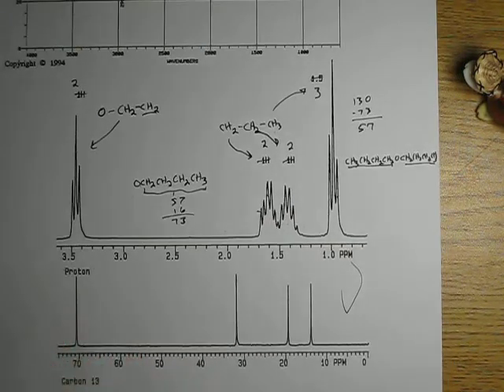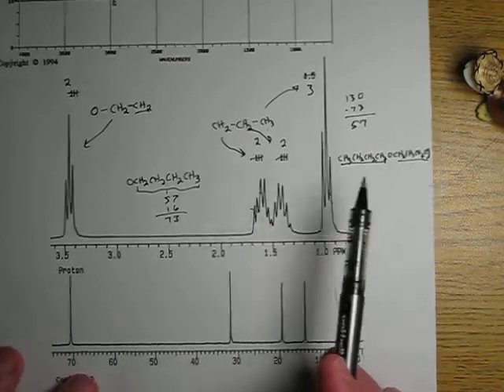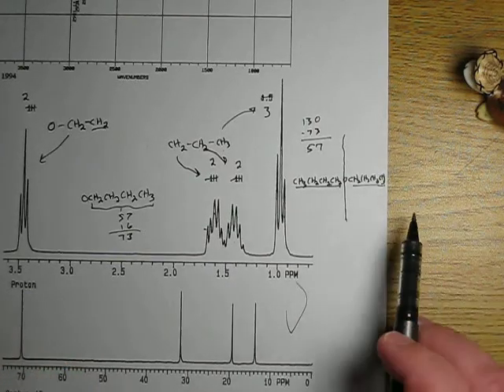Having symmetrical molecules is what really will give you fits when you're first starting solving NMR spectra. Because how would you know it's symmetrical? What told me it was symmetrical? There's nothing. But we just happen to realize, oh, what's the mass that is missing is the exact mass of this part. And we realize if this molecule has a center of symmetry, this side is the same as that side.